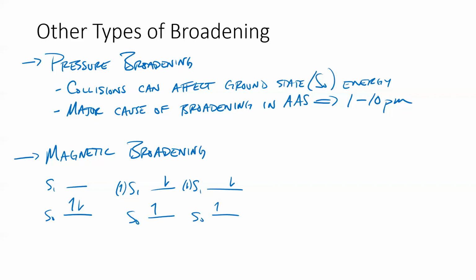This can also be a pretty meaningful broadening, up to 100 picometers. But only in the very largest of atoms. If we're talking about some smaller metals, the orbitals that we're moving into just aren't large enough to have that big of an angular momentum, and therefore it's not as big a deal.